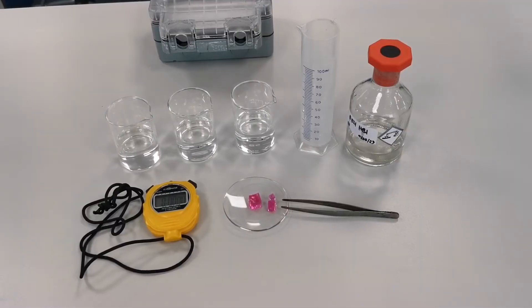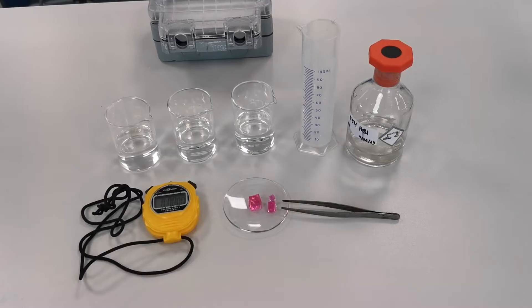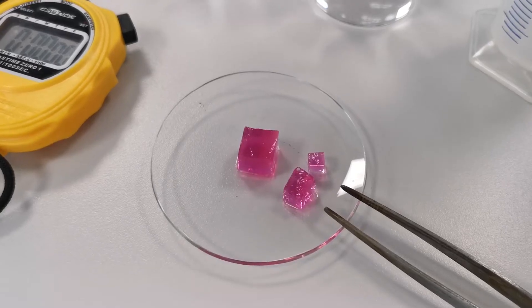Hello everyone and welcome back to another Science for Breakfast experiment. Today we're going to explore how surface area to volume ratio affects the rate of diffusion.